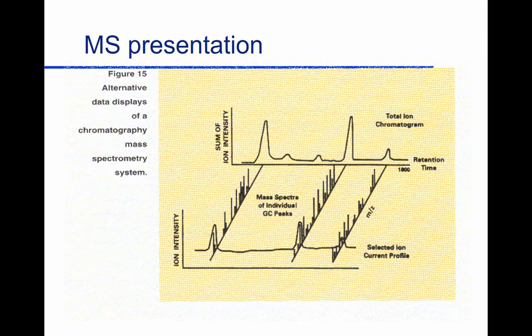And so, when you have this mass spectrometer running, and your effluent is coming out of some source, we'll stick with a gas chromatograph, it's always generating ions, always measuring ions. And so it simply draws something that looks like a chromatogram, measuring just the ions that are being formed. If a lot of analyte comes out of the GC into the mass spec, it gives you a large peak, a small peak, and so on. But many times a second, it's sampling: what are the fragments? So many times per second, we're getting a continuous collection of spectra.